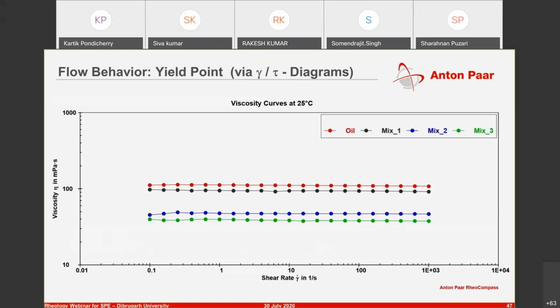So the funny thing about oils is that in most cases they are Newtonian. So in a way, they are not affected by shear rate. And that's exactly what you're seeing here. So what am I actually presenting? This oil here is a standard oil, an SAE certified multigrade oil. And then what you have done here is that you have added different amounts of additives to that.